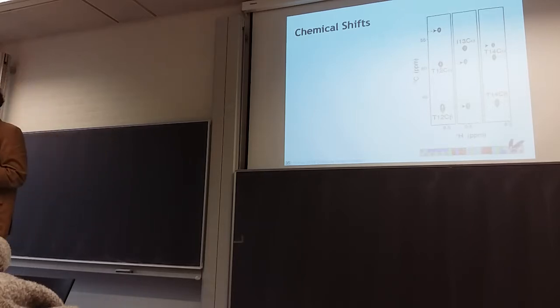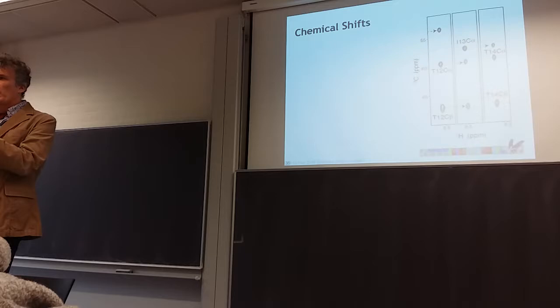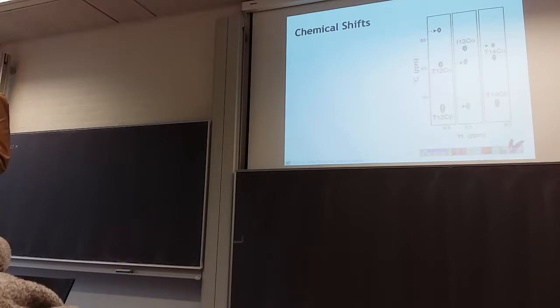The other thing is that what you need to do is actually find out who is on which frequency, because they don't come with numbers. They're not sequential. In crystallography, in the electron density, residue one comes first, and then residue two comes second, because it's a three-dimensional arrangement of stuff, right? So the protein chain has to go through that. That's not true in the spectrum. Yeah, residue one might resonate at a different frequency than two, but they don't have to be in the same order.